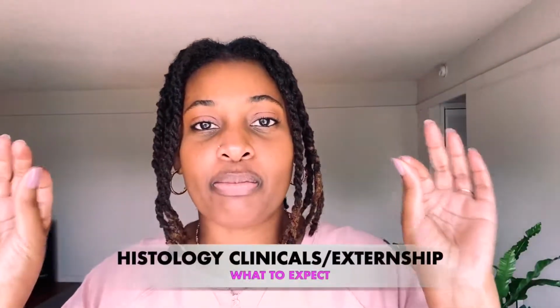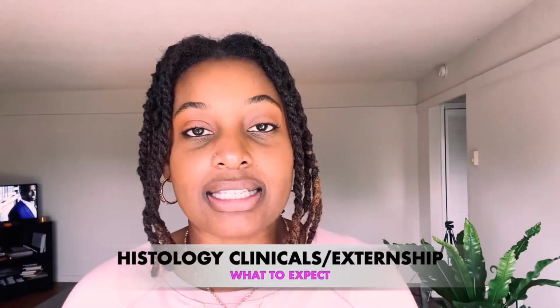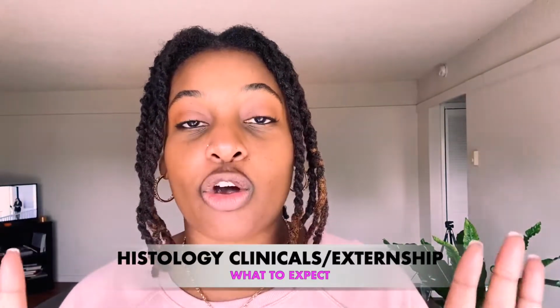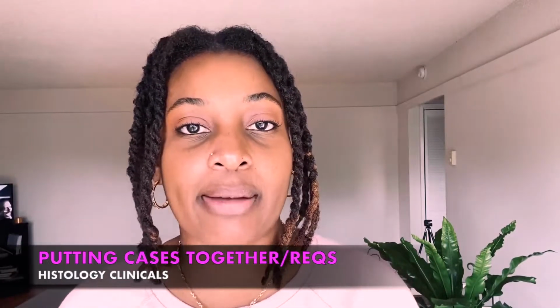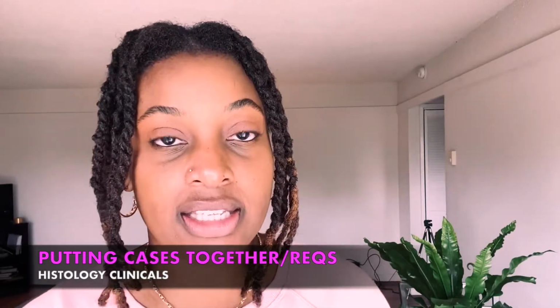What's really important to understand whenever you guys are at clinicals is how to read a requisition and how to make sure that your slides and your cases are put together before the pathologist receives them. Now, in every lab, you may not even have to touch a requisition, especially if it's a bigger lab and there are lab techs who have the paperwork that goes out with the cases.